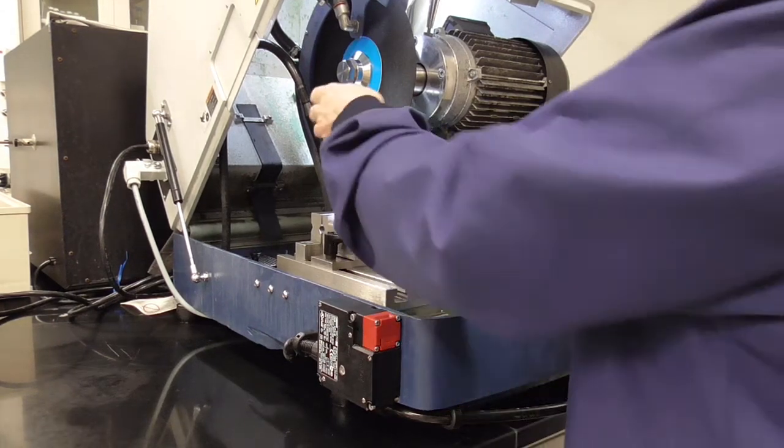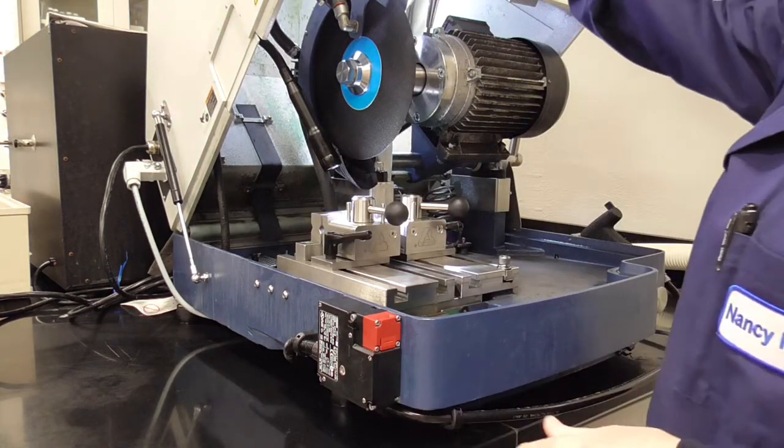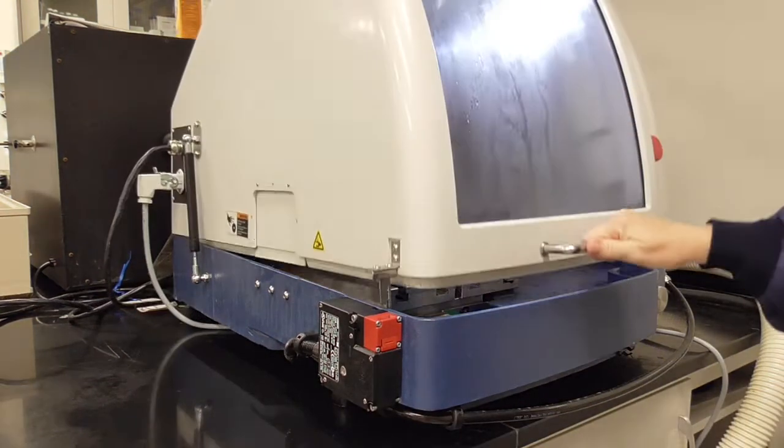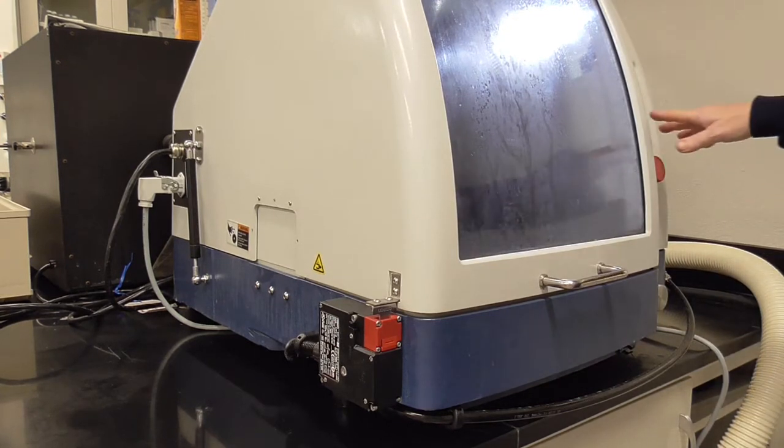Once your sample is in position, make sure the light is not going to be hit by the saw. Close the door and then hit start.